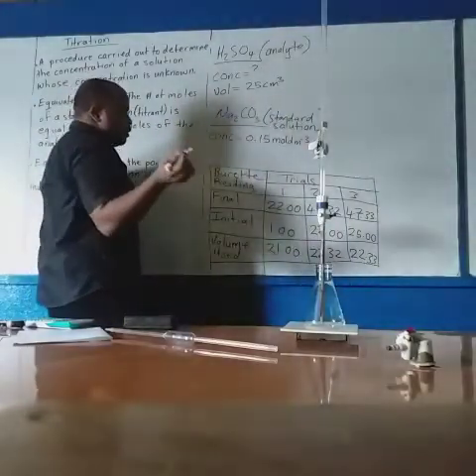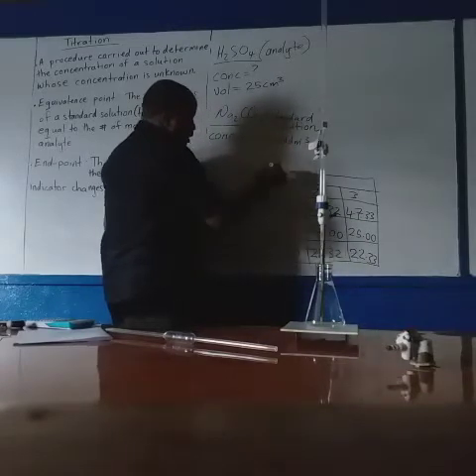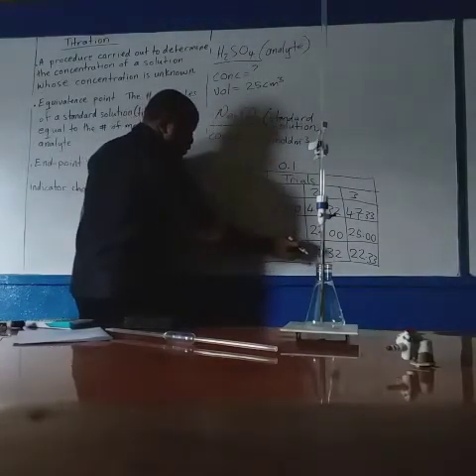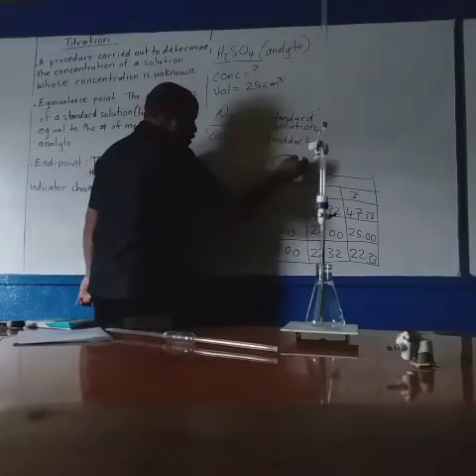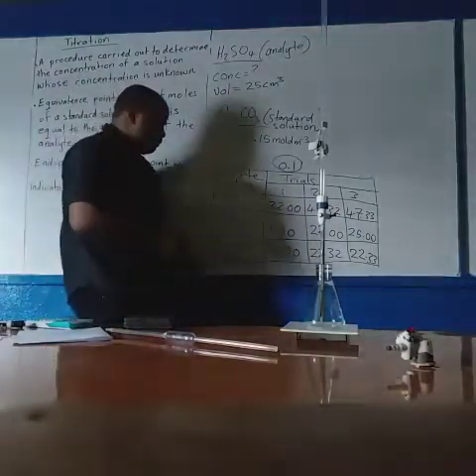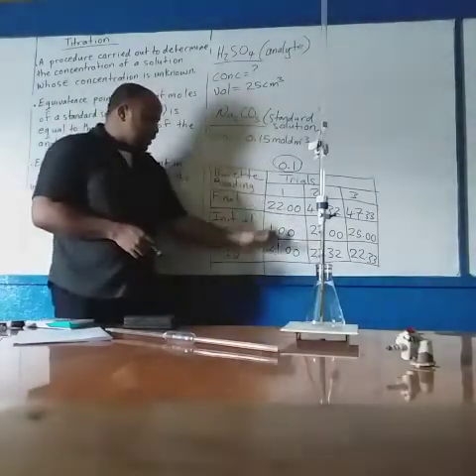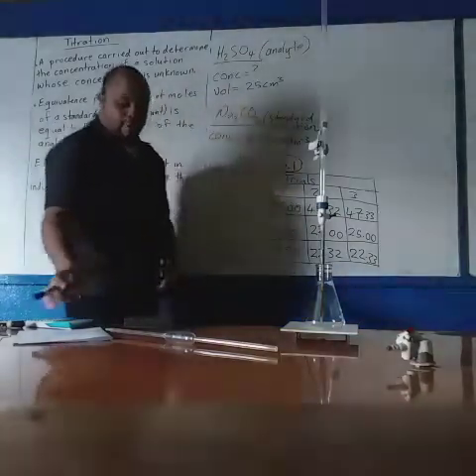Now for most institutional chemistry classes, when you are doing the volume used from one titration to the next, the difference should not be greater than 0.1. At least for CXC, for CSEC and CAPE, the volume used from one titration to the next should not differ by more than 0.1.